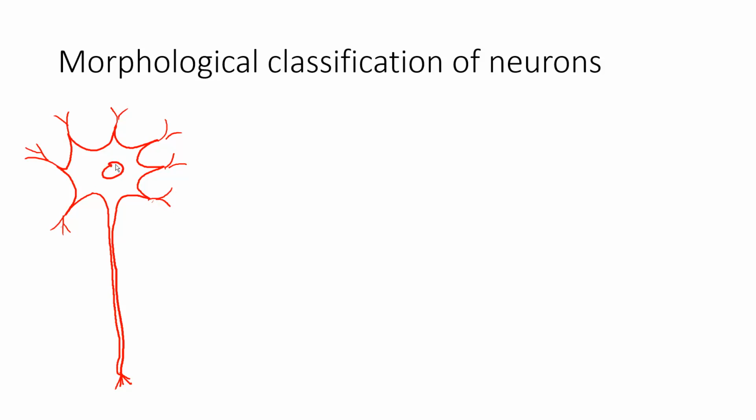And there's our nucleus. So because this neuron has many dendrites attached to the cell body, as well as the axon coming out of the cell body, the cell body has many poles. So we refer to this as a multipolar neuron. These are the most common neurons.